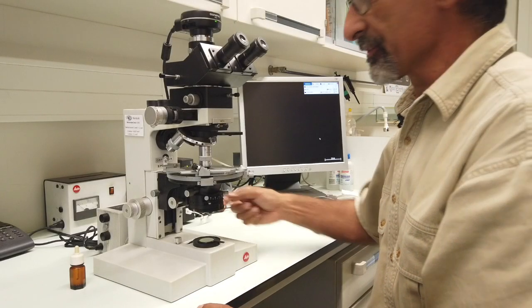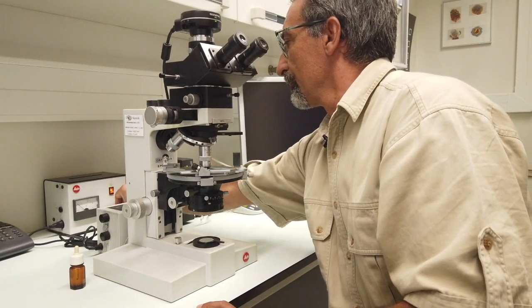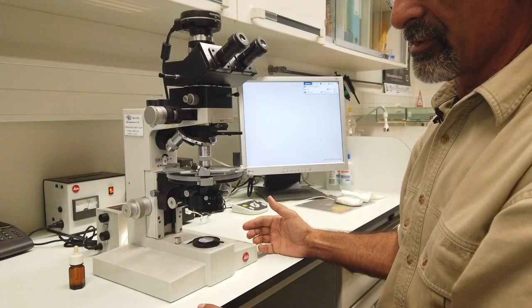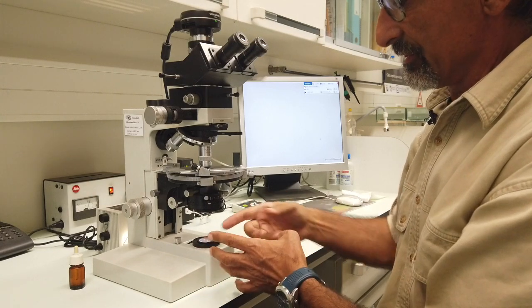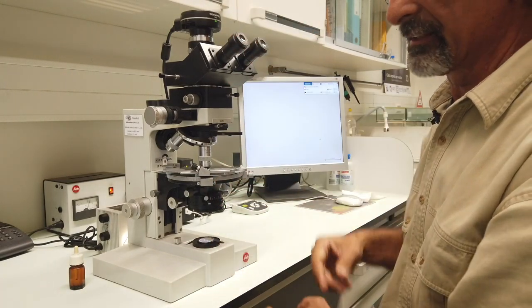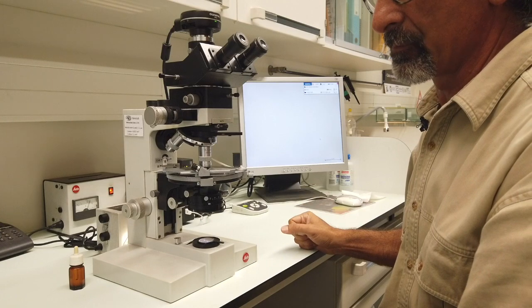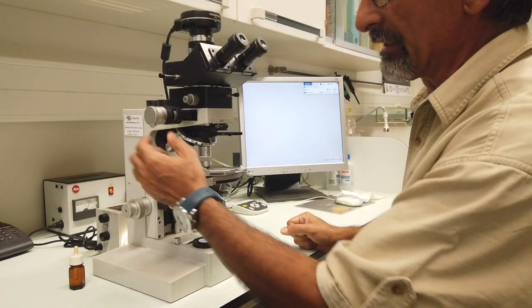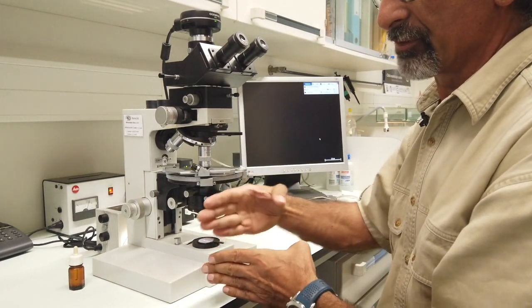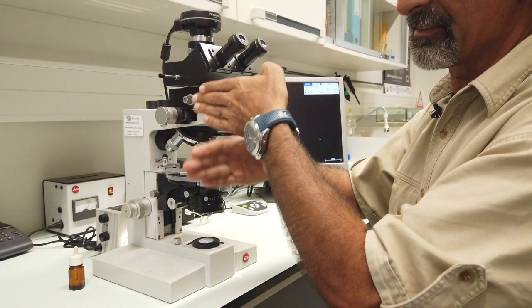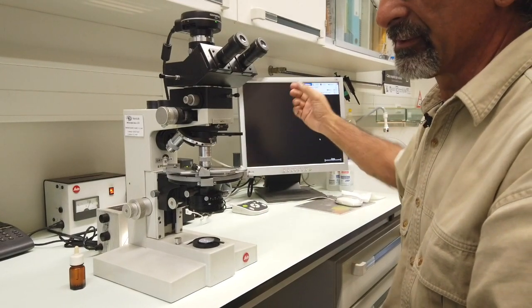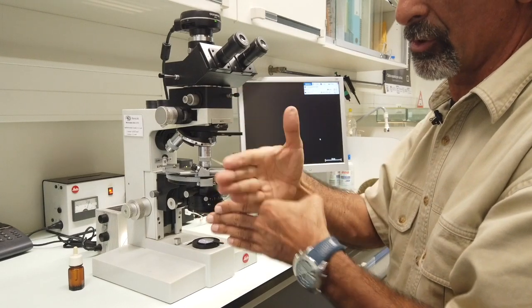So let me turn the light into the microscope. So in these conditions, light vibrates in all directions, passes through the polarizer vibrating in one direction and it comes out like that and we can see it on the screen. But if we introduce the analyzer, the analyzer blocks the light that is vibrating from the polarizer. The analyzer does not allow it to pass through and so we have the dark field. We have the dark field in cross-polars or cross-nickels.